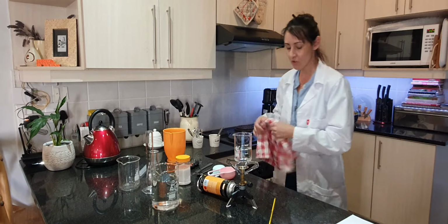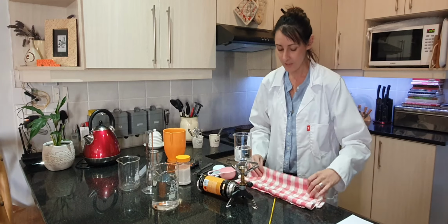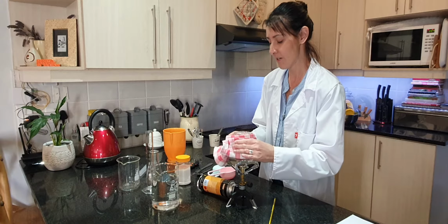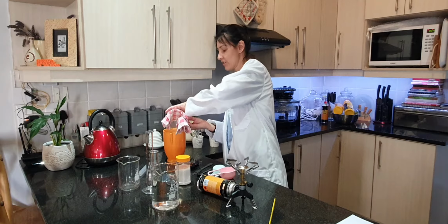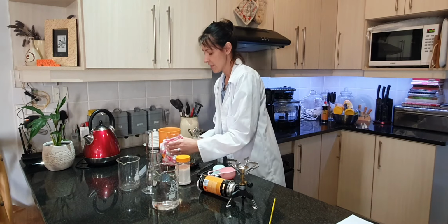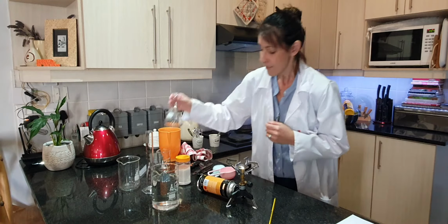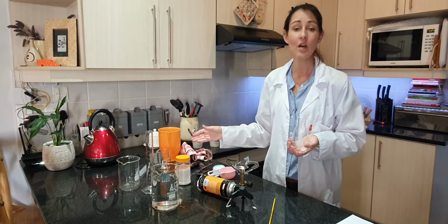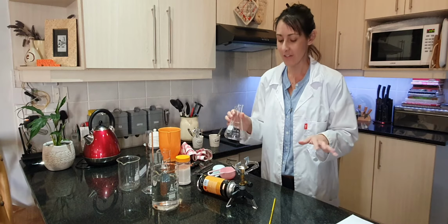Okay, so I'm just going to take this beaker off. When you heat a glass beaker, it is quite warm, so I don't want to burn myself. So I'm just going to empty it into this container that I have over here, and I'm going to leave it to dry over there. So the next one, I'm going to use my conical flask because I don't want to use that glass beaker now because it's already warm.